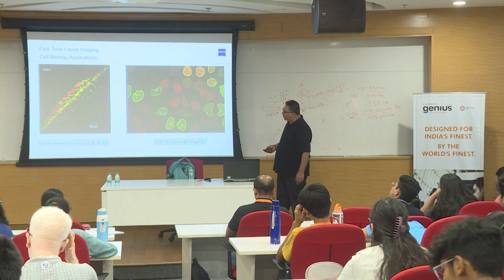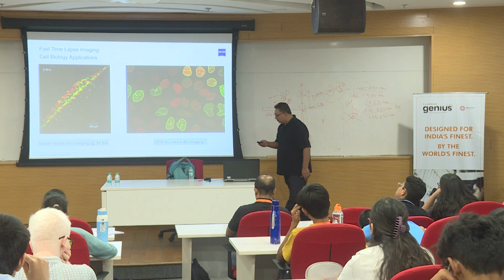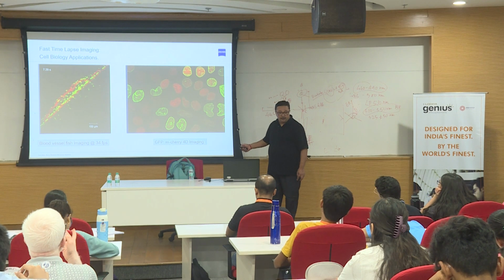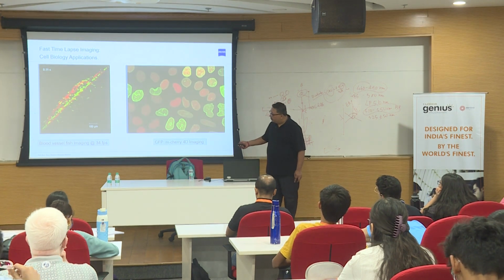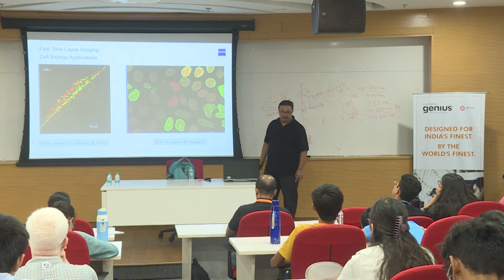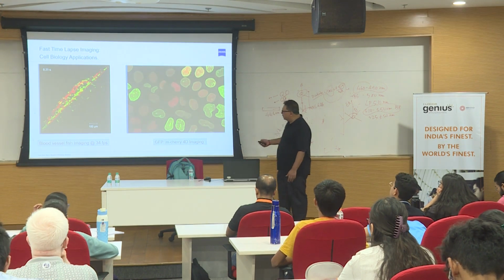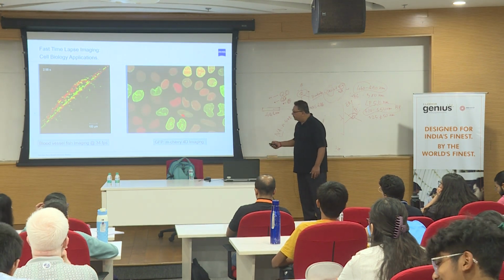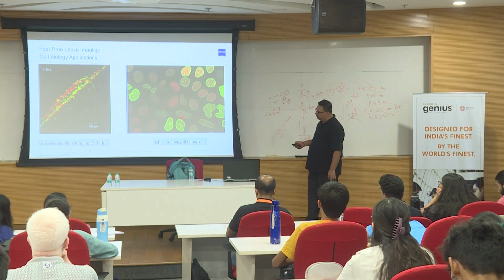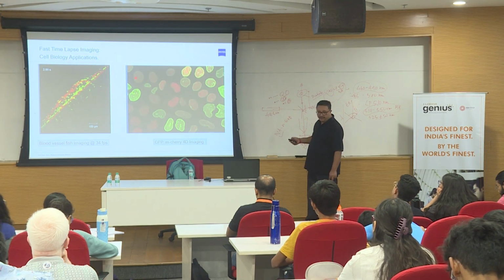Now this is all single protein. Now you see dual protein over here, or dual color. Now you see this is a blood vessel. This is a zebrafish imaging. You can see the red blood flow and you can see the green structure, and this is time series data in seconds, like 20 seconds of imaging, and it's fast imaging. If you see this particular image, this is again multiple color, two color protein, so GFP, mCherry, X, Y, Z versus time, and then you can see the dividing cell over here, one cell dividing into two over here.